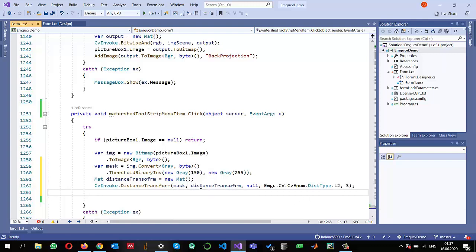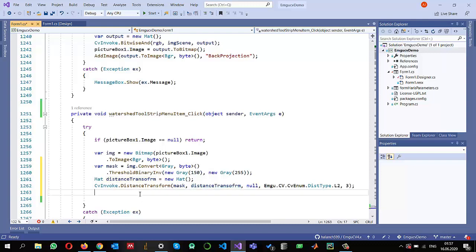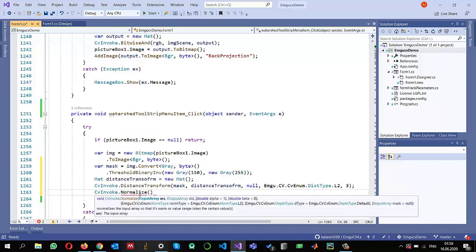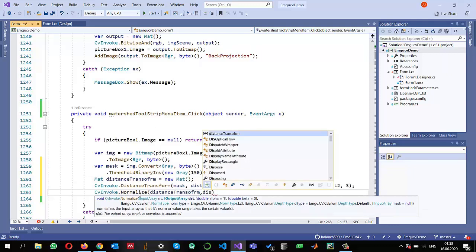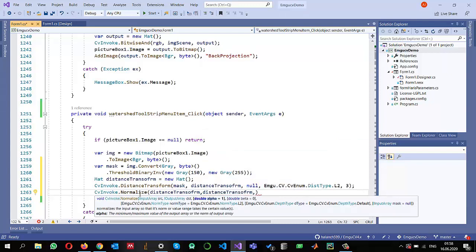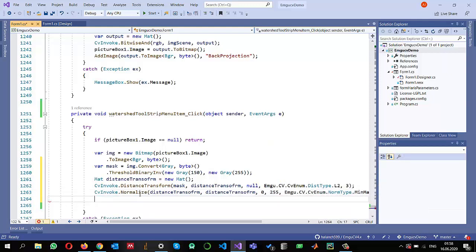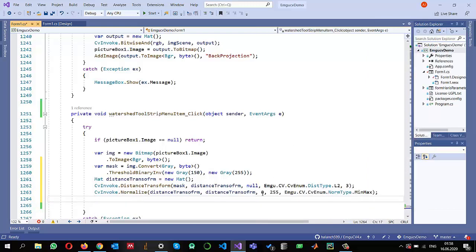These distance values can be anything, so I will normalize them between 0 and 255 using `CvInvoke.Normalize`. The input and output are both the `distanceTransform` Mat, the minimum value is 0, the maximum is 255, and the normalization type is MinMax. This converts the distances so they look like a grayscale image.